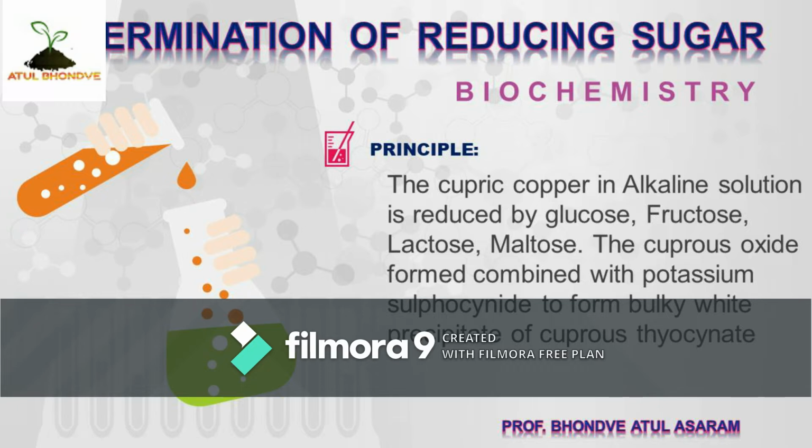It will avoid the formation of red or yellow precipitate, and the complete disappearance of the blue color of the Benedict's reagent indicates the completion of the reaction.